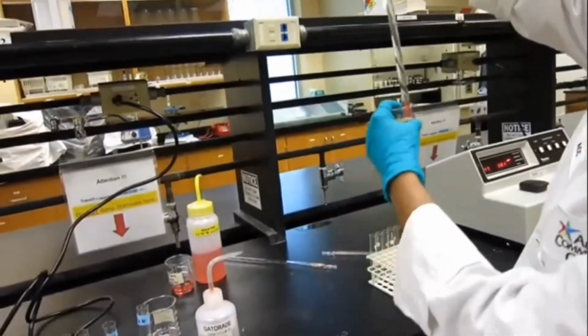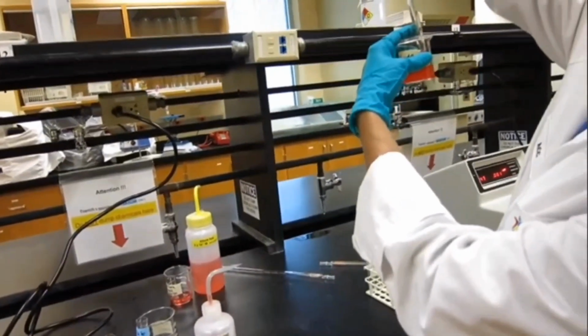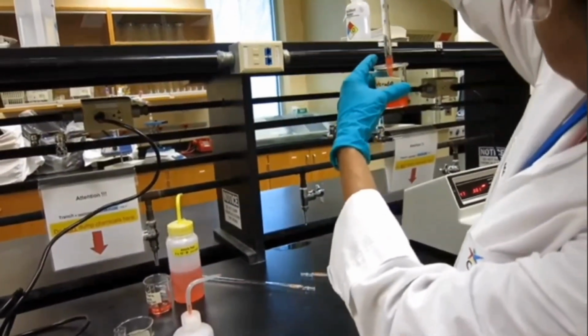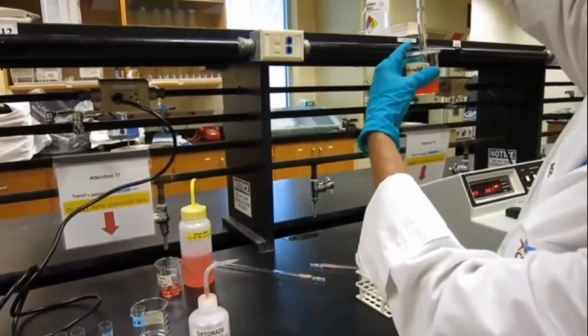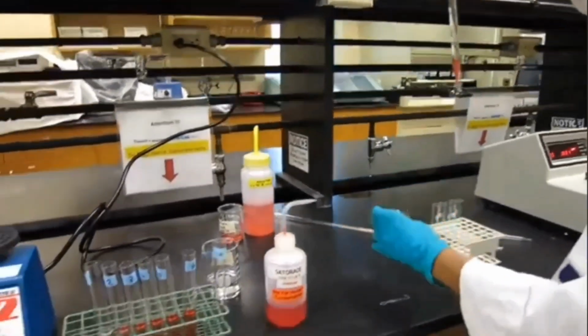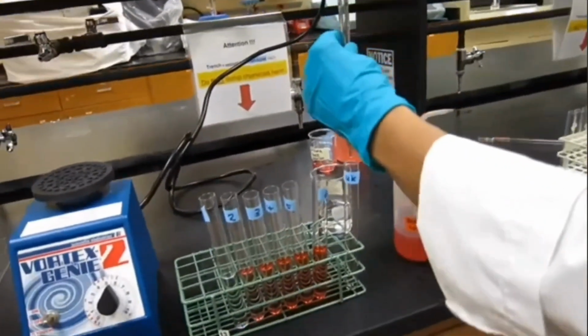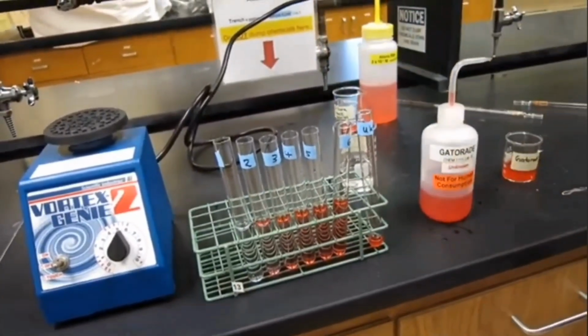So the solutions that we made, their absorbance is going to be less than 1. But the Gatorade that you buy from the store, that's going to be more than 1. It goes about 2.5 or so. Beer's law works well below 1 absorbance. So we have to do a dilution. That's what we are doing right now.